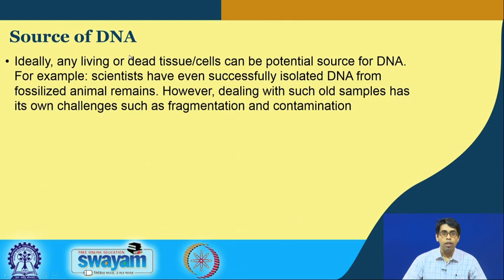So, what is the source? The source of the DNA can be anything. It can be any living or dead tissue, and normally you have to extract the cells from the tissue. These are all potential sources for the DNA. Here is one example where scientists have been able to successfully isolate DNA from fossilized animal remains, because as I mentioned, DNA is a very stable molecule, but depending on the quality of the DNA, it can be isolated.